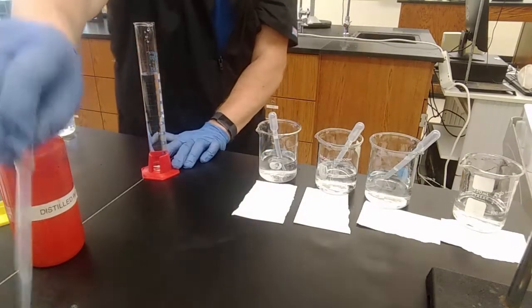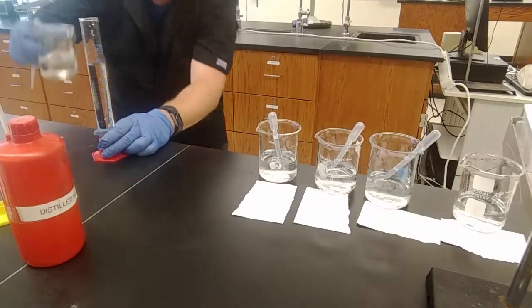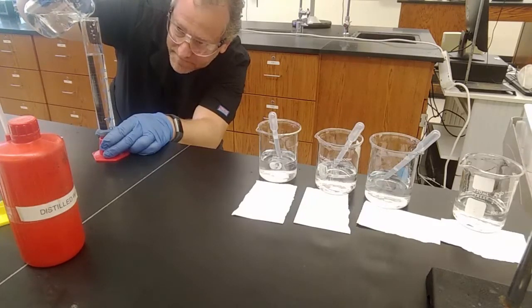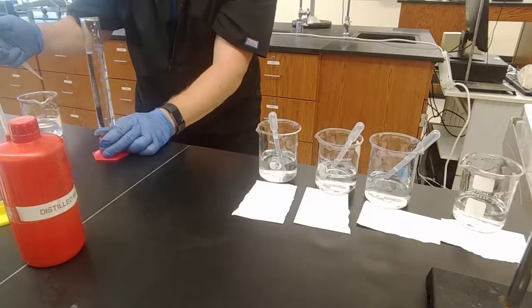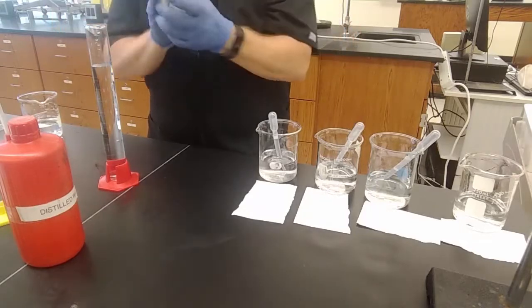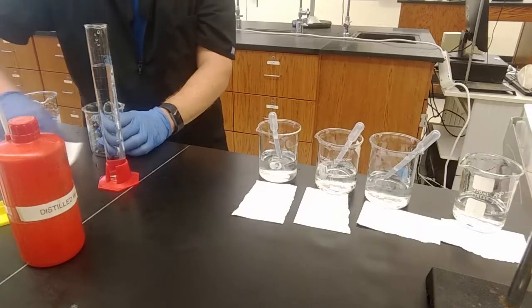Good. And 10 milliliters of the 14. I'll just pour, at least at the beginning. Perfect. Into our next beaker, which is labeled 13.